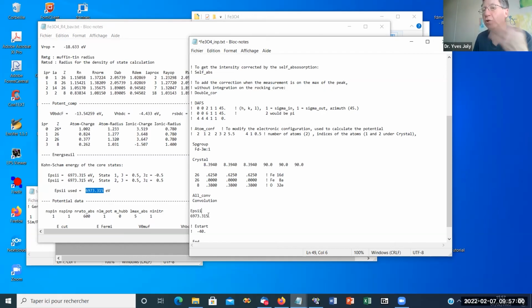So first a calculation with one of your samples, one of your in-data files, you write the value of the reference, and after you report it in all your calculations with all the structures you are calculating. And so it will be automatically shifted by the difference between this value of the reference and the new value calculated for what you are calculating. Have you caught more or less?